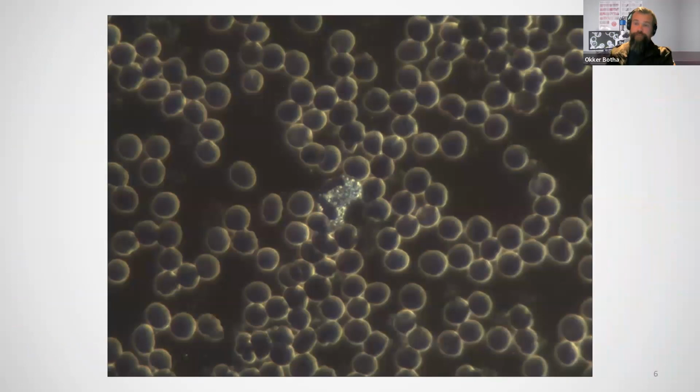Right, so another microscope that's sold and advertised as a dark field live blood analysis microscope, and this is the type of quality of image that one would get with it.